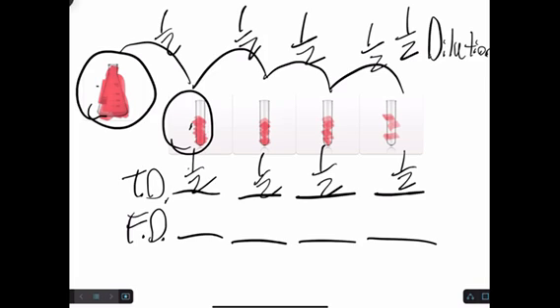For this beaker, we want to take half of the concentration and put it into this one. So what would that be? 1/2, or 2 to the -1. For this one, we want to take half of this. So what is our original? We want to take half of our original concentration, which is 2 to the -2, which is 1/4.